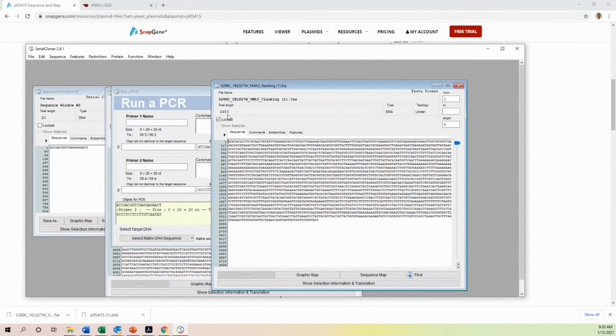take the sequence at around 601 to 640, all right? Because I said 400 base pair upstream of the open reading frame, so 601 to 640. And downstream will be 1483 plus 400, that's 1883. We're going to take 40 nucleotides, so that'll be 1844. So we're going to take 1844 to 1883.